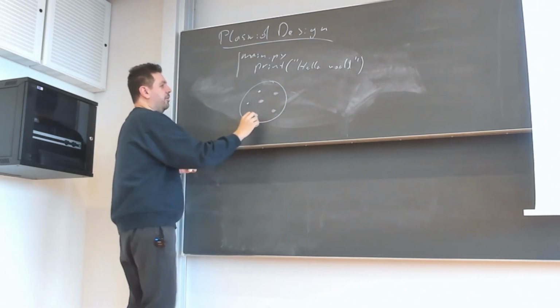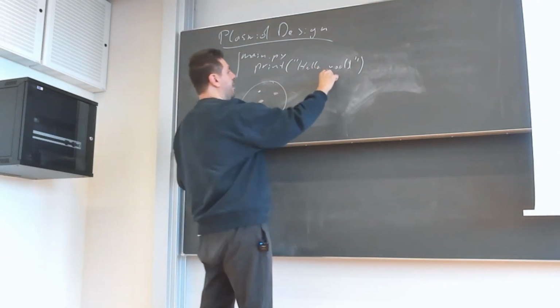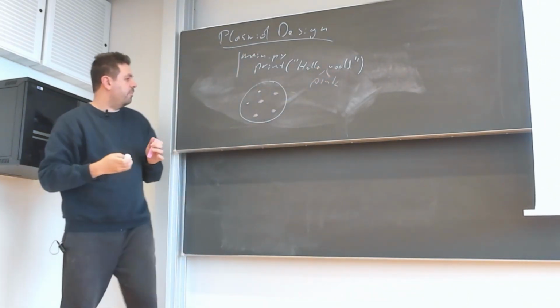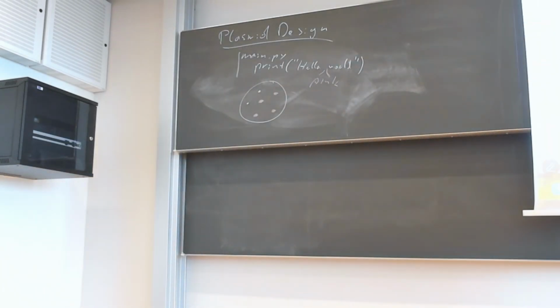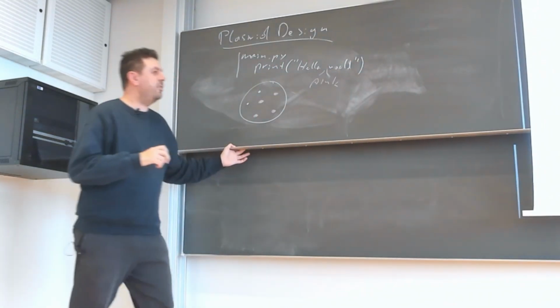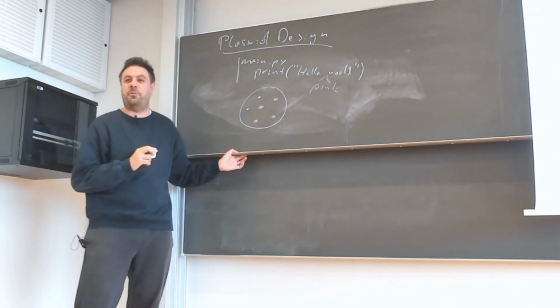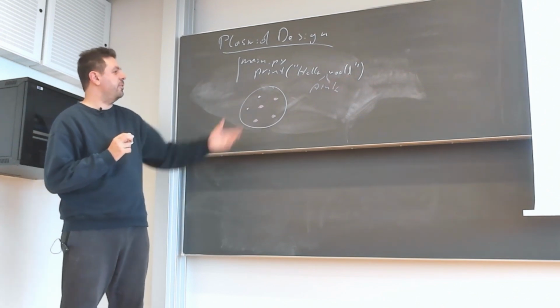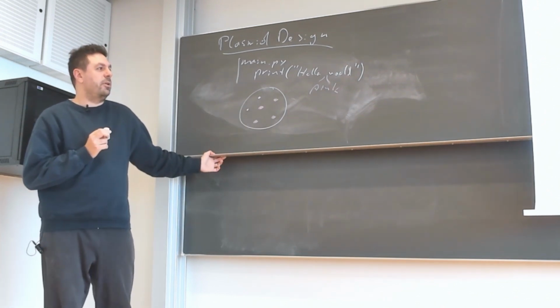We want to see a hello pink world kind of. So this will be our hello world. Sounds very easy, but you will see it's already involved to do this in code. And I think we see a lot of concepts when we just do this very simple cloning and this simple design.